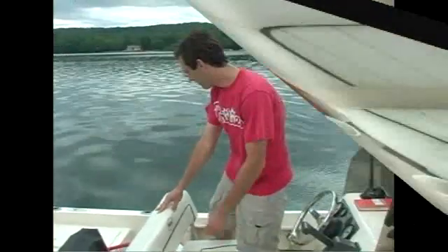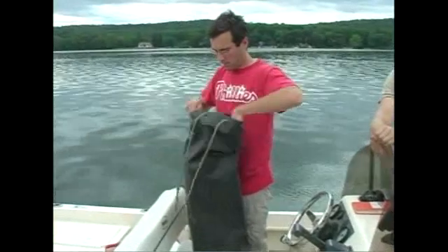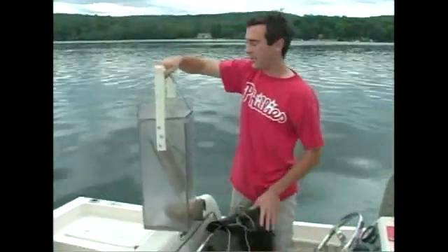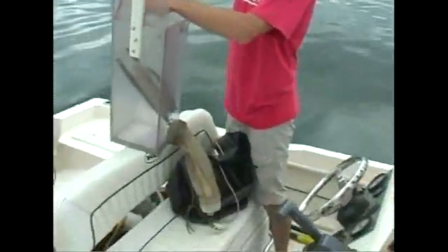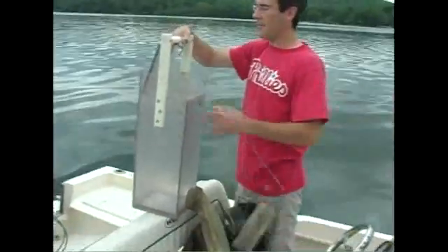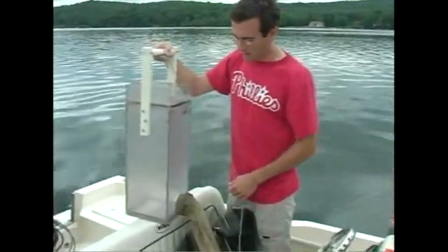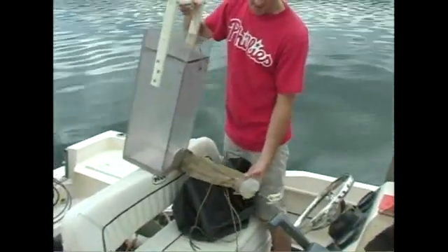To get zooplankton, we use this guy. This is called a Schindler-Pitelka trap. You basically just lower it down to your depth, and the doors on the bottom and top are open when you're lowering it. You bring it up to the boat, pour it through this net, and it lets the water out and keeps the zooplankton in.